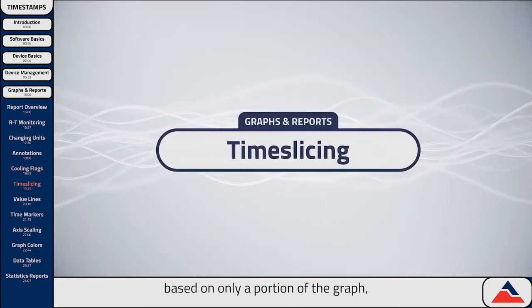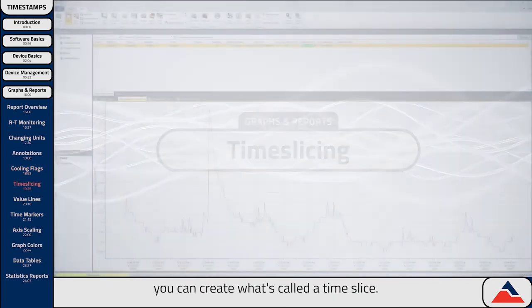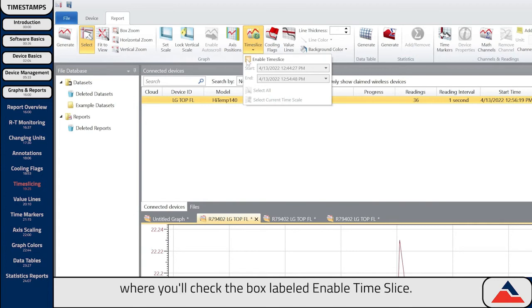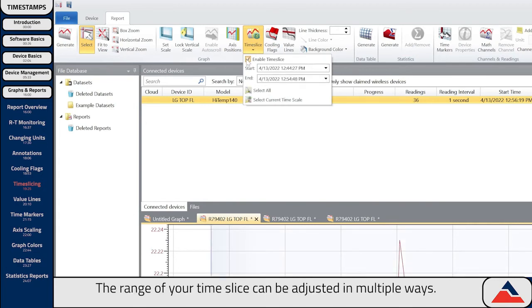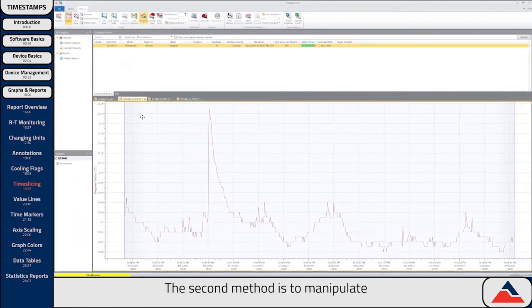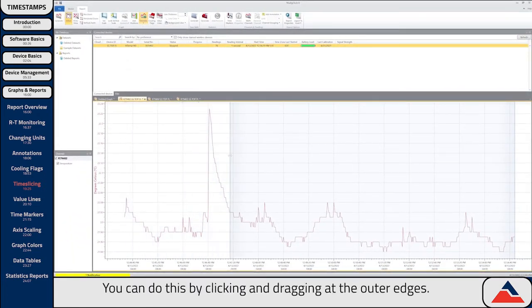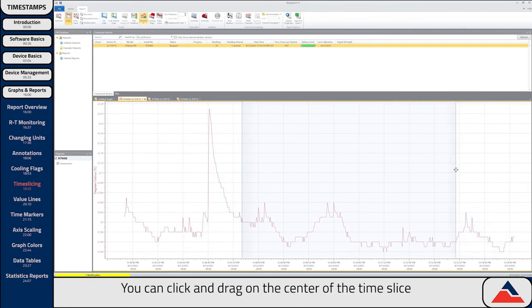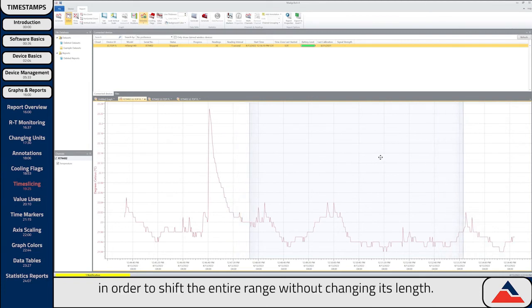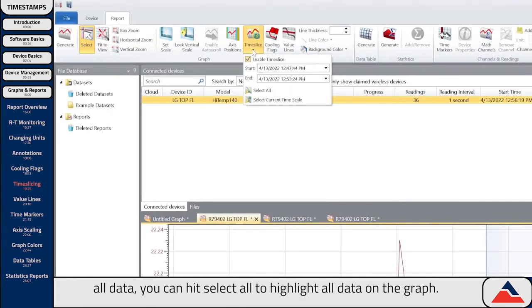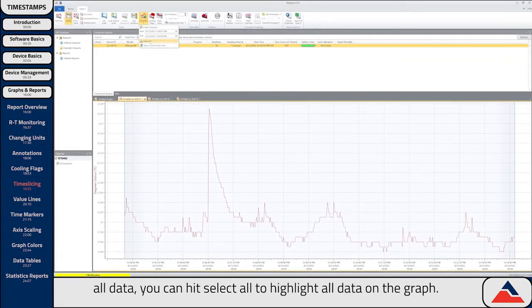If you'd like to highlight data based on only a portion of the graph, you can create what's called a Time Slice. Begin by selecting Time Slice in the Reports menu bar. This will bring a drop-down menu where you'll check the box labeled Enable Time Slice. The range of your time slice can be adjusted in multiple ways. The first method is to enter the start and stop times of the Time Slice in these boxes. The second method is to manipulate the Time Slice directly on the graph by clicking and dragging at the outer edges to narrow and widen its range. You can click and drag on the center to shift the entire range, and if you'd like to reset it, you can hit Select All to highlight all data on the graph.